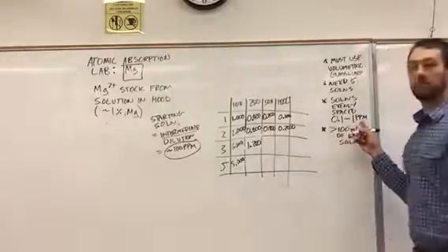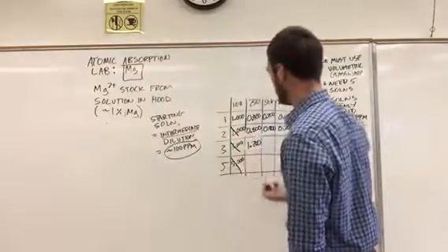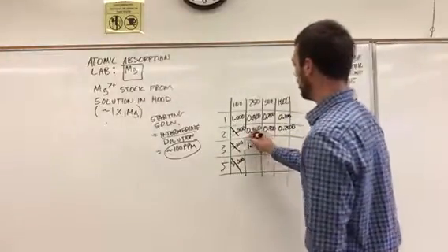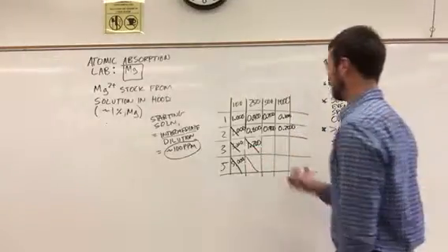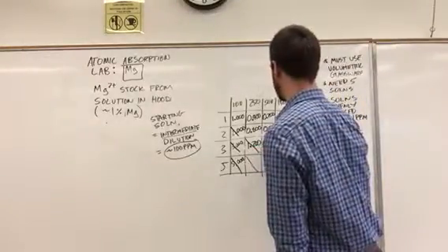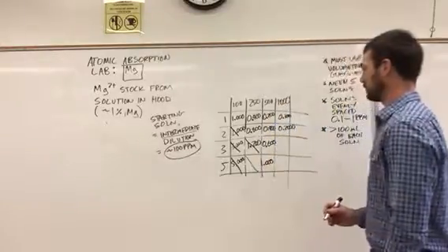So we only need to go up to 1 ppm. So I really didn't even have to do these, right? I went above 1 here, and so I definitely don't have to do this one, right? This one would be 0.6. This would be 1.000. Okay.